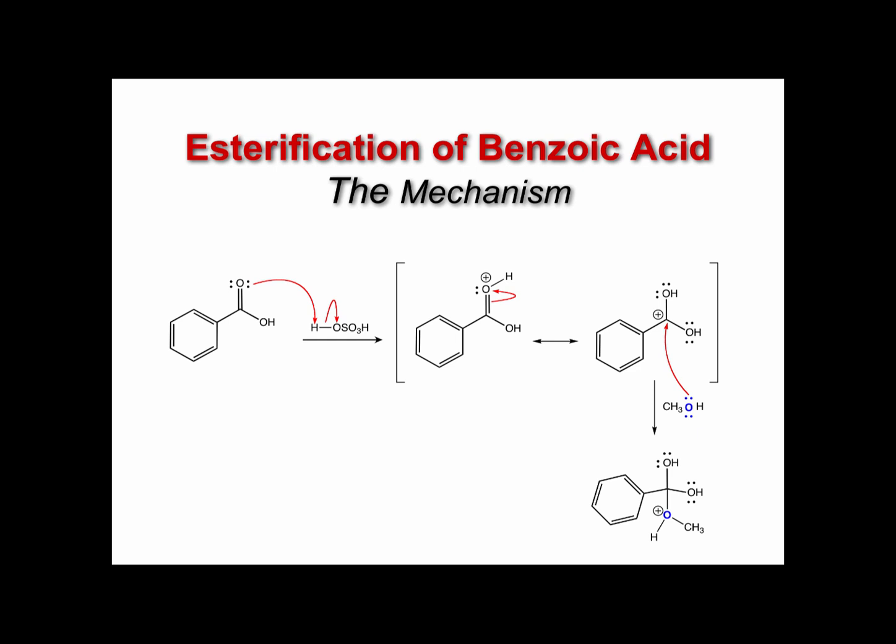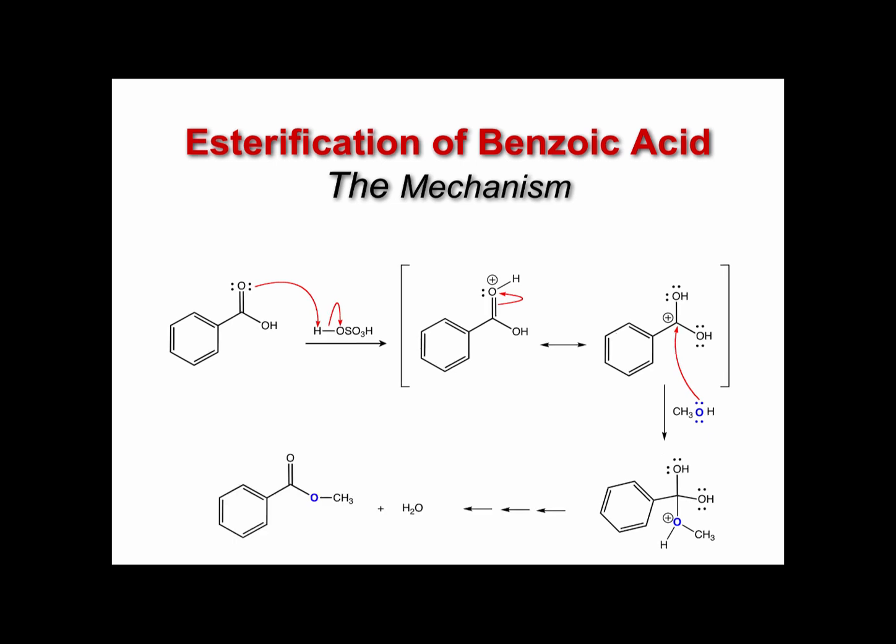So how do we proceed? Well, it's a good question. A bunch of things happen, and eventually out pops a water molecule as a product and the ester. So I want you to sit down with pencil and paper and develop that reaction mechanism, and we've asked you to include that reaction mechanism in your notebook. Think about how this is going to work, and then go through the steps of writing out that full mechanism.